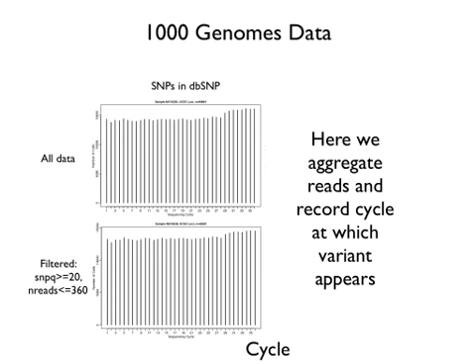So this is a histogram of those locations. Let's see how many there are. That's 15,000. So that's a lot of reads. And it looks pretty flat, which is exactly what we want. We want the SNPs to be equally distributed across the read. It shouldn't matter. The reads don't know it's a SNP. It just reads it, and so that's good.